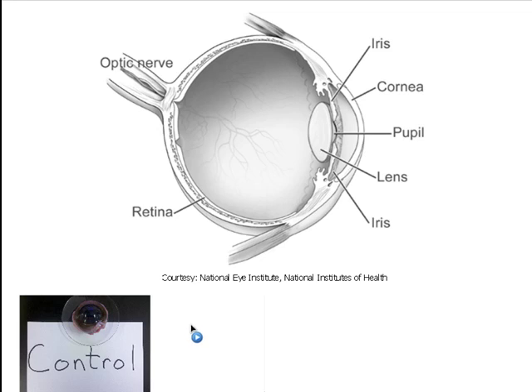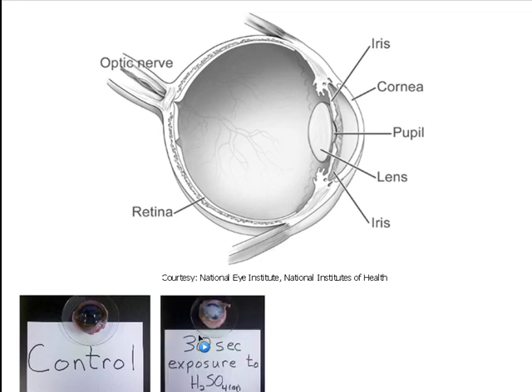We're going to talk about three different potential scenarios. In the first scenario, you have an exposure to the sulfuric acid — it gets splashed in your eyes, and nobody is helping you get across the room to the eyewash station. So by the time you manage to stumble across the lab and get to the eyewash fountain, it's about 30 seconds.